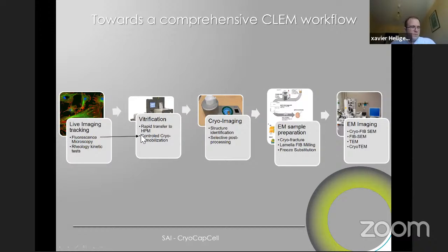But then we've seen in the previous presentation that some people have been developing cryo imaging, especially Anna Sartori, who's now at the Pasteur Institute. And from what we heard from Harald and Eric Betzig and the cryo clamp, the idea is to be able to go from live cell to cryo imaging of your sample. The advantage of cryo imaging is that you will not have any photobleaching, which is essential because you can do super resolution because of no bleaching. And you can take as much time as you wish before you start to do your electron microscopy. So there's a critical step here in cryo imaging.